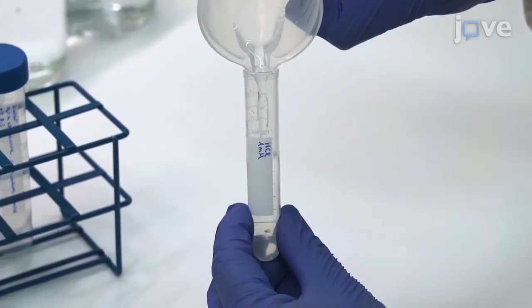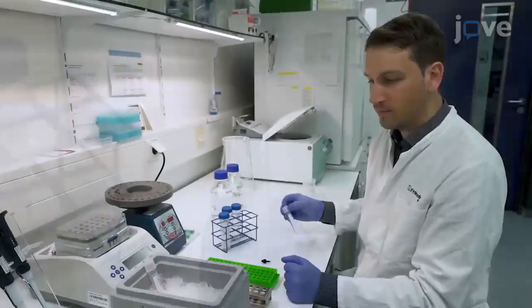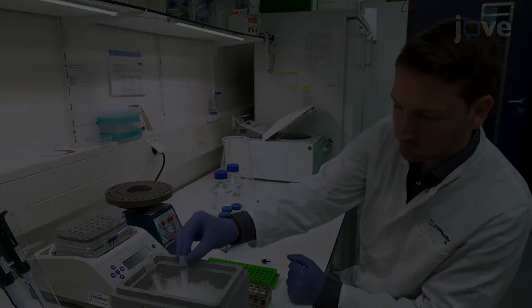Then prepare 20 milliliters of 1 millimolar hydrochloric acid in a tube and incubate it on ice for at least 20 minutes.